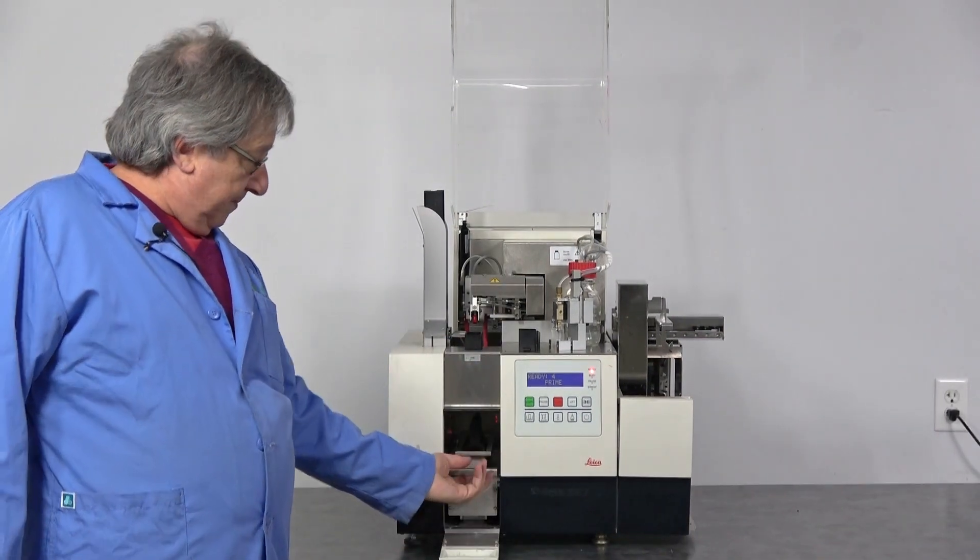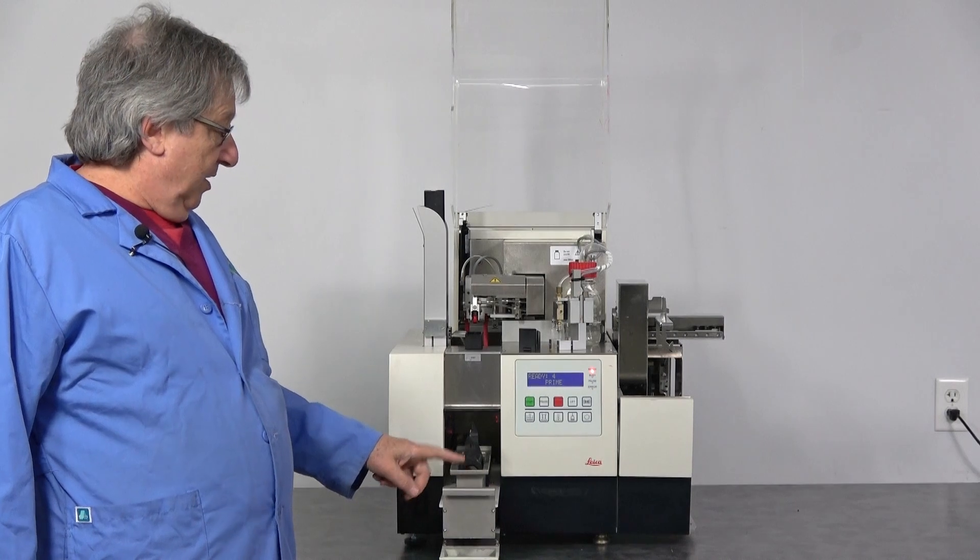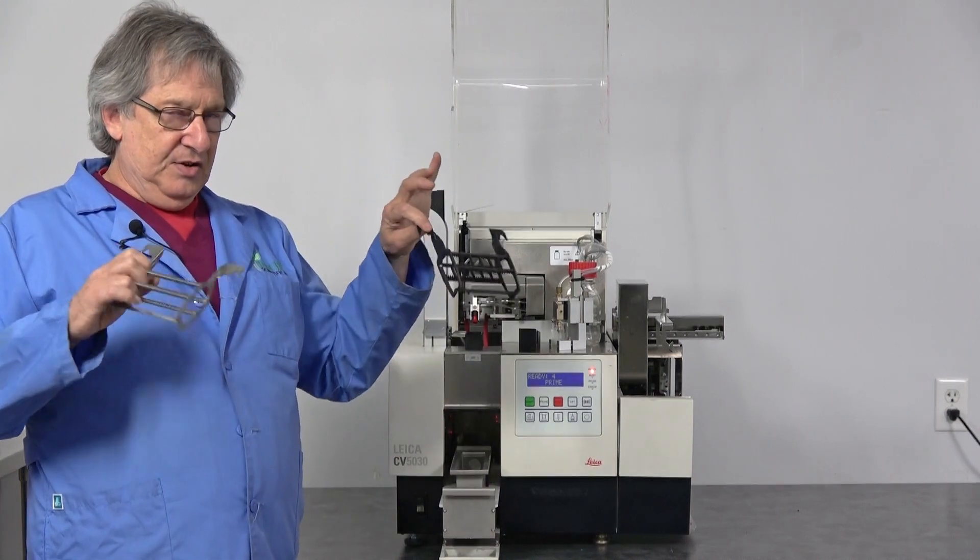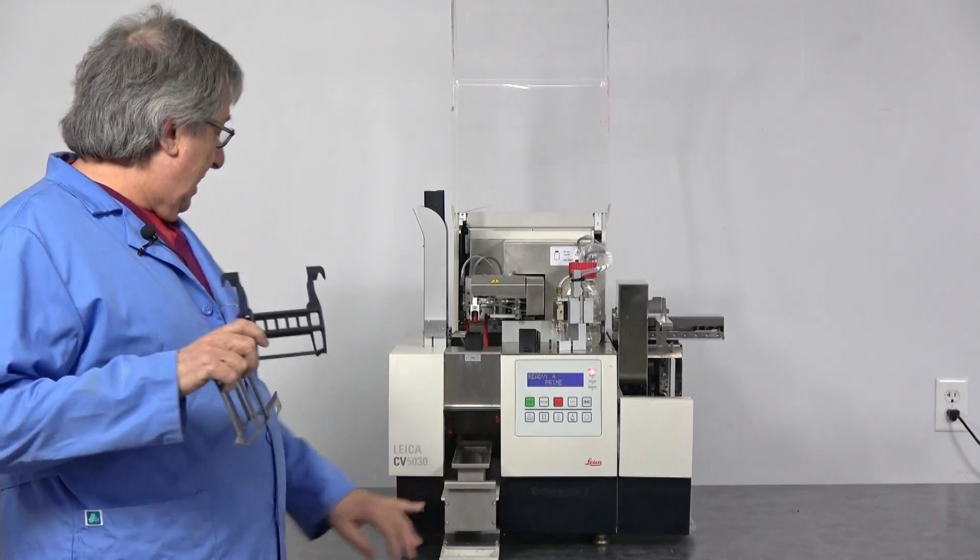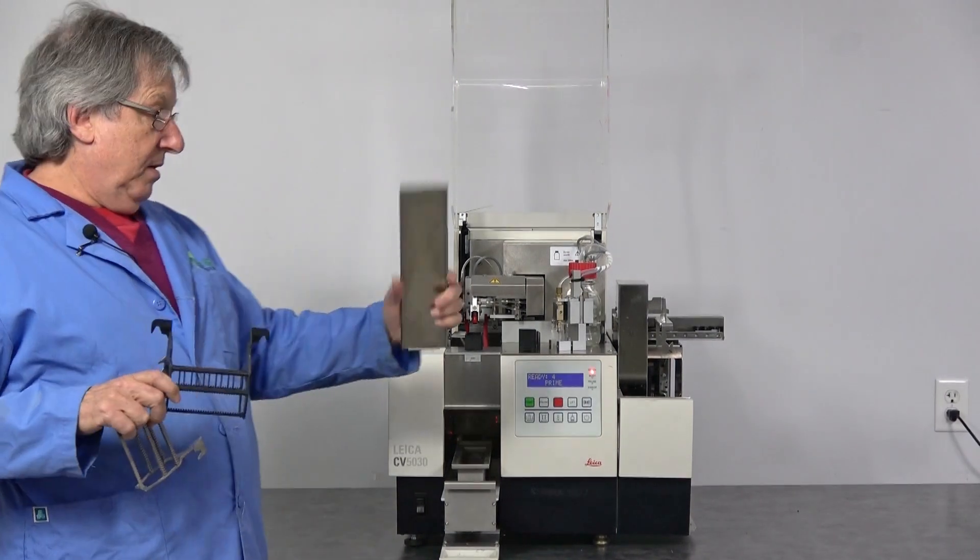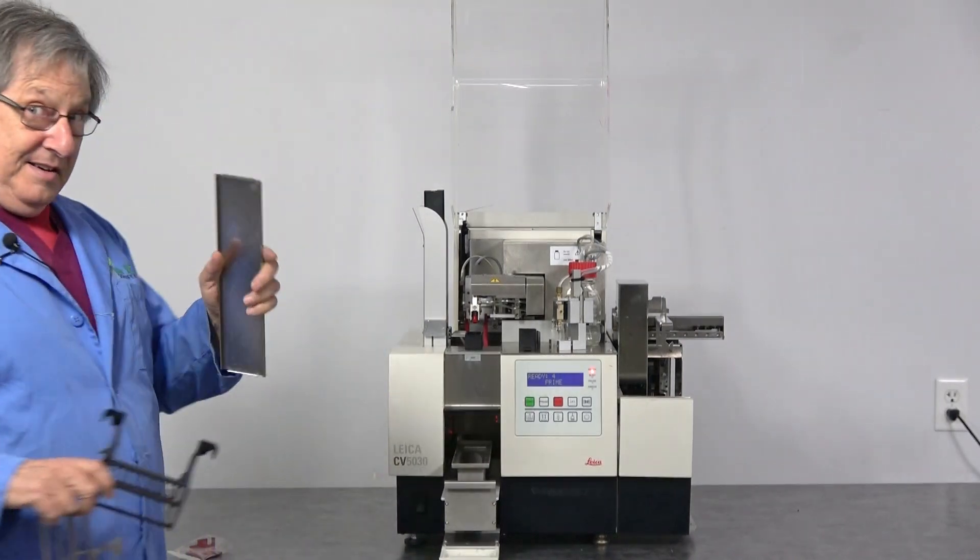That metal box right there is one thing you want to make sure is there. Having these is not important. I have these. They can buy these. Leica will have them. It's also nice if you have the tray cover, but that's not a deal breaker.